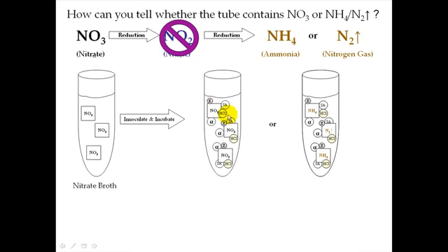And again, what these chemicals do is force any remaining nitrates in the tube to be reduced to form nitrites. And because you already previously added the sulfanilic acid and alpha-naphthylamine that serve as nitrite detectors, at this point you should see a red color, right? Because anytime nitrites are in the presence of these two things, it'll produce that red color.